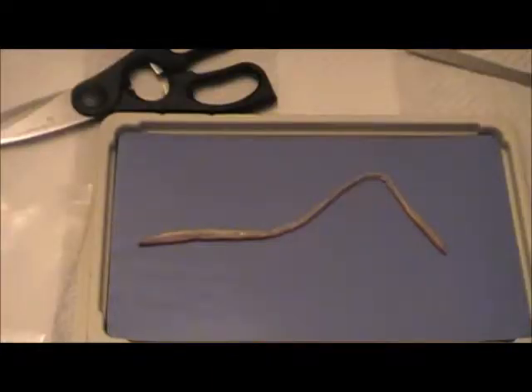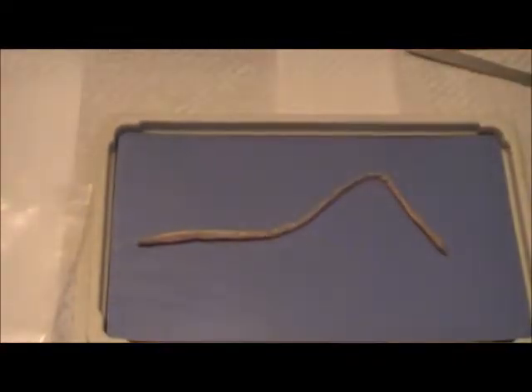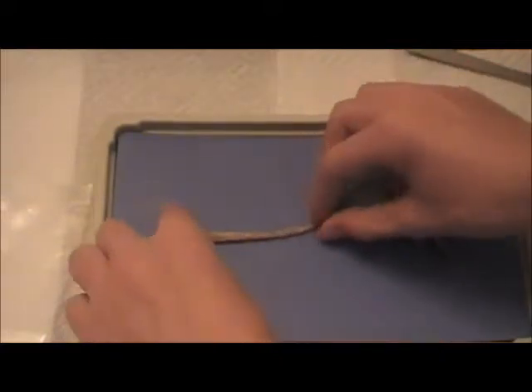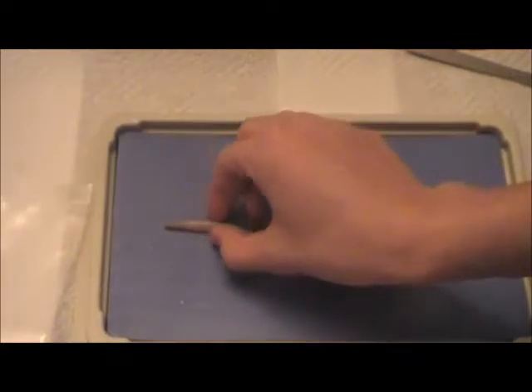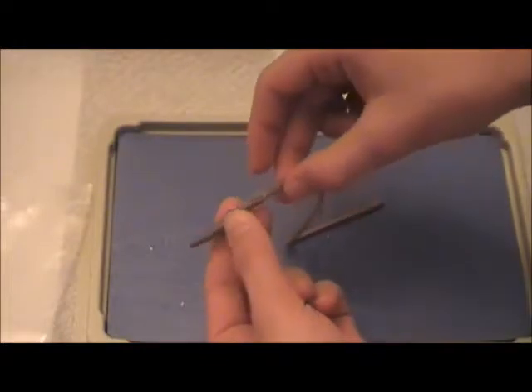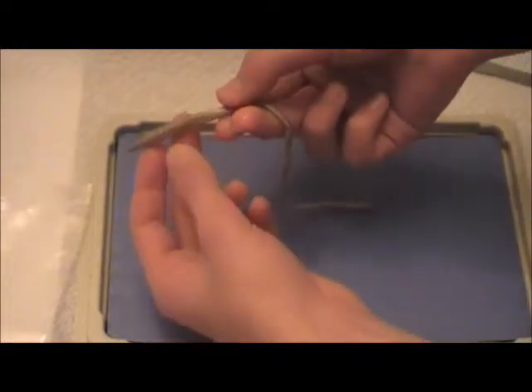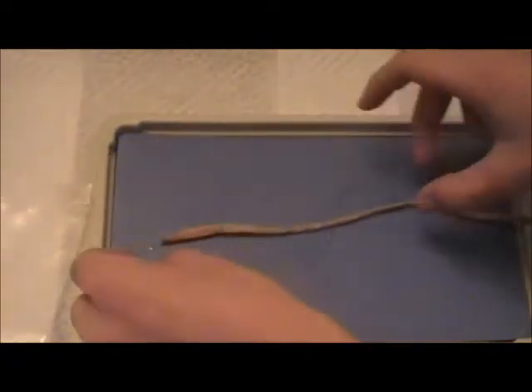So the first thing we're going to do here is identify the dorsal and the ventral surface of the worm. It is pretty easy to tell. It's harder on a preserved worm because the color may change. But okay, you see, the black side is the dorsal, and then the lighter colored side is the ventral.